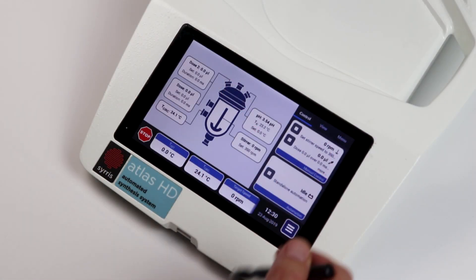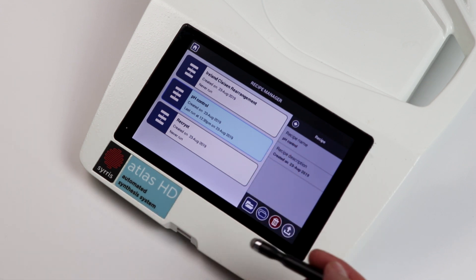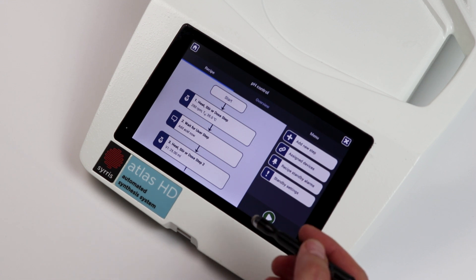The Atlas HD base includes a number of features including the ability to create automated recipes in minutes directly from the touchscreen base without the need for a PC.